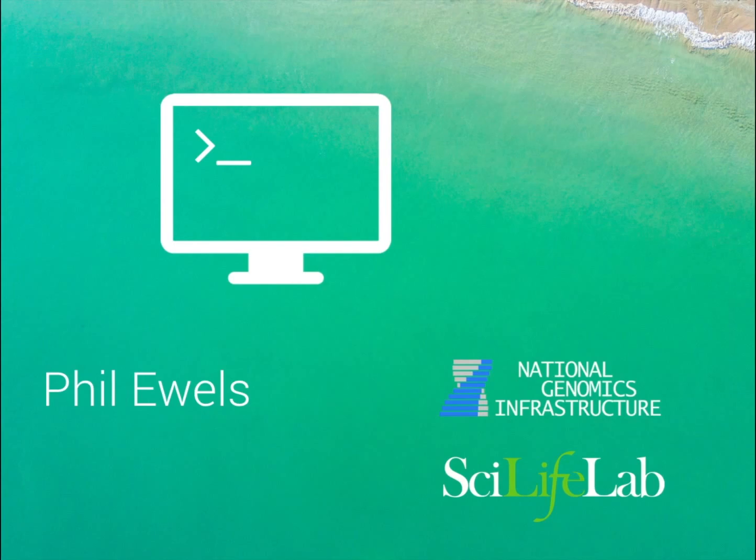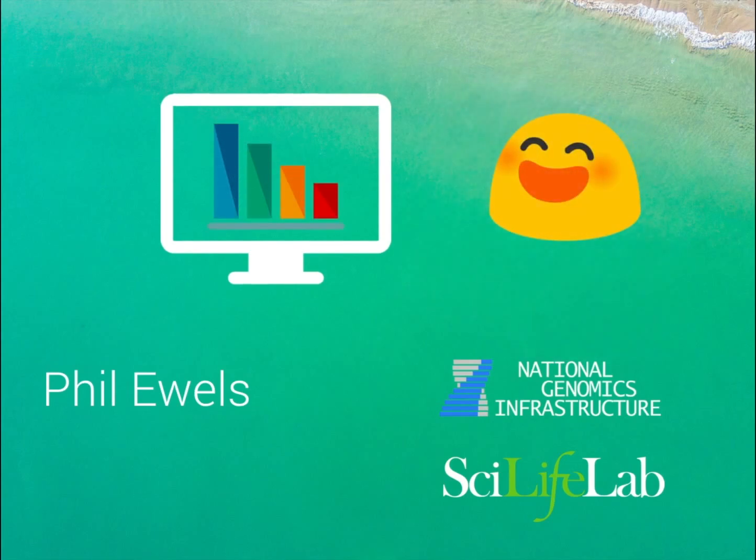This is very difficult, especially with the large numbers of samples that we process, and generally made everyone who's involved with this pretty sad. So I started MultiQC as a project to try and visualize this data and plot it and make it easier to understand, and hopefully make everyone enjoy their lives a little bit more.